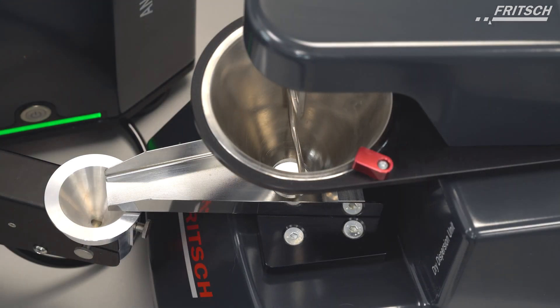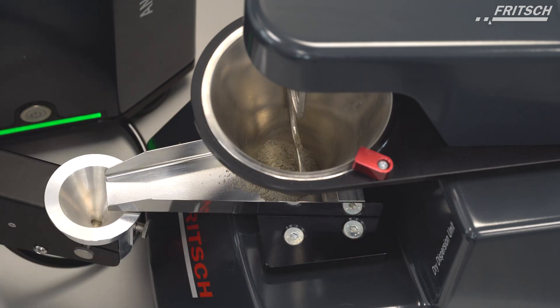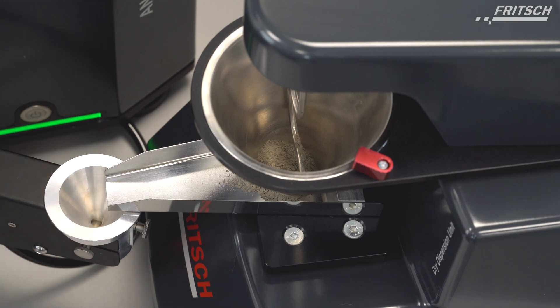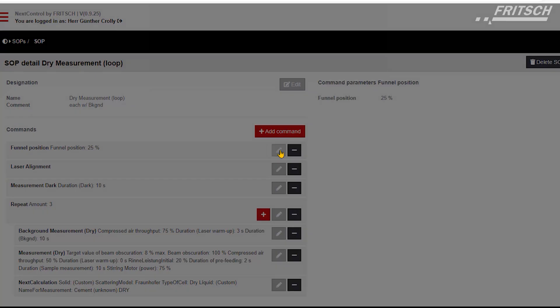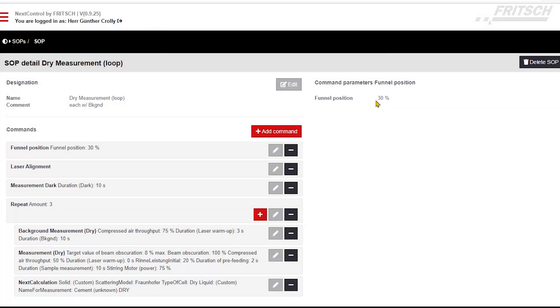Making a measurement always starts with adding some sample into the funnel. The stirrer takes care that the sample is always fed without getting stuck. We then go into the software and into the menu point SOPs. We select the SOP we want to use and can adjust certain settings. The funnel height controls how much sample will go underneath the funnel, similar to the manual control we just showed on the hardware. Next steps are laser alignment, dark measurement, and three consecutive measurements consisting of a background measurement and the actual sample measurement. At the end, of course, the most important step — a calculation.